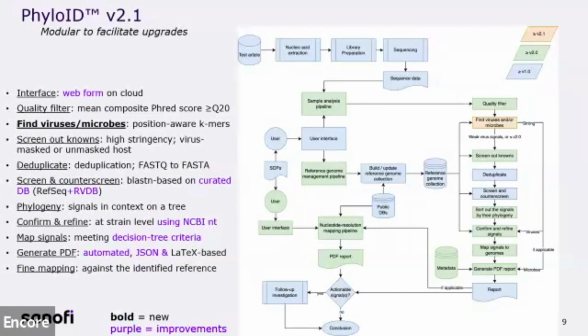And so here what we did is to use our K-mer approach to mine RVDB for anything that was not well recognized using RefSeq. Instead of incorporating 1 million RVDB sequences, we really only doubled the size of RefSeq. And then in an iterative process, you add the sequences of the most value from RVDB into the database. You rerun the test. There's still some missing. You rerun it, rerun it, rerun it. I think we do 64 iterations. And then eventually everything is identified that's in RVDB.